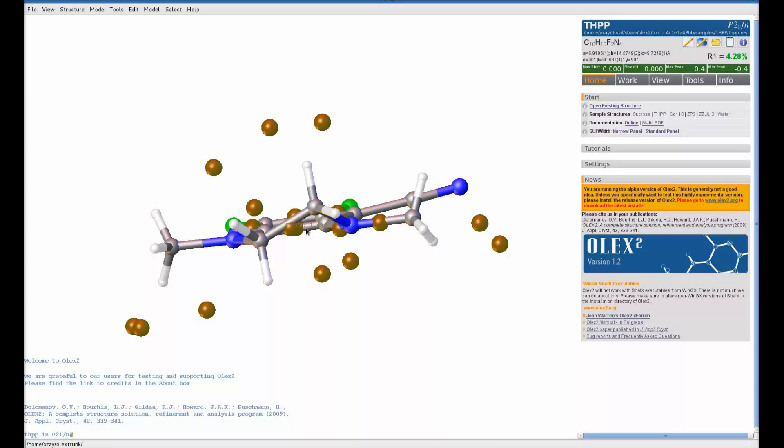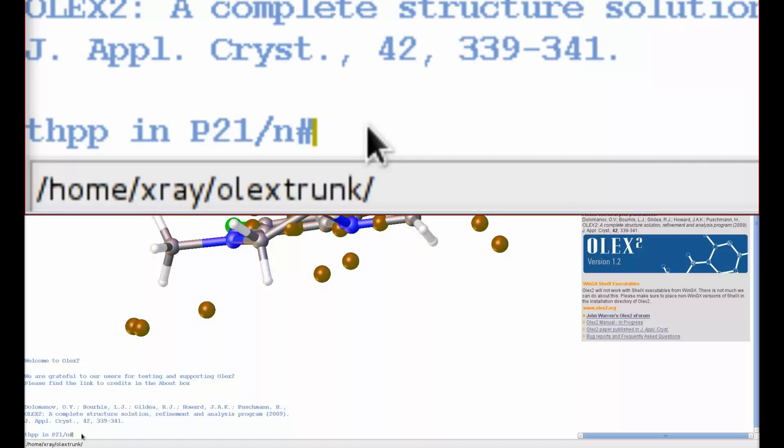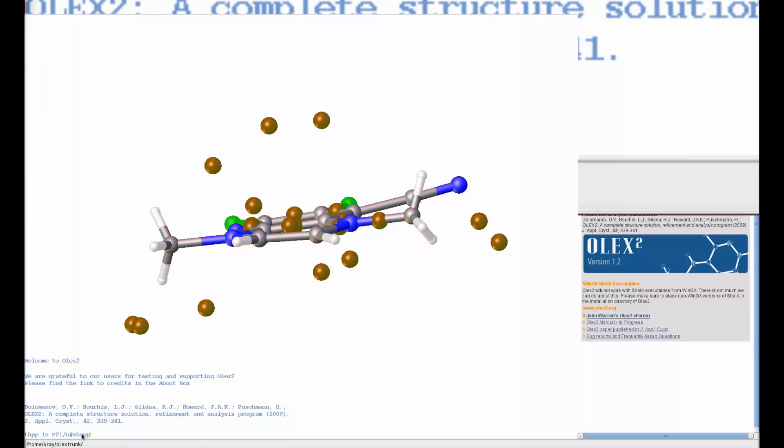If you wanted to see the other disordered component, we can do the same command: SHOWP 0 2. That will just show us the second component.